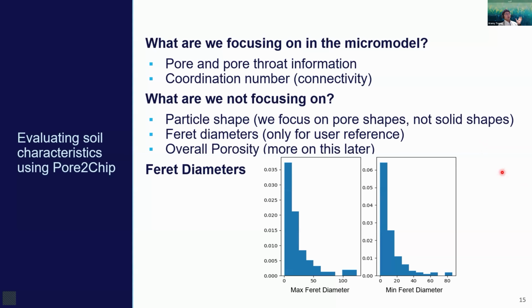Another thing I want to talk about is the overall porosity. And what I mean by that is the percentage of pore space compared to solid space. We do have control over this, and I'll talk a little bit more about that later when we are constructing the micromodel.